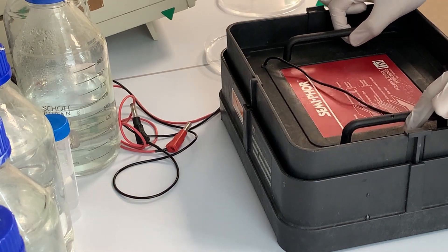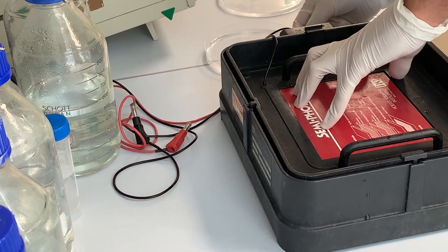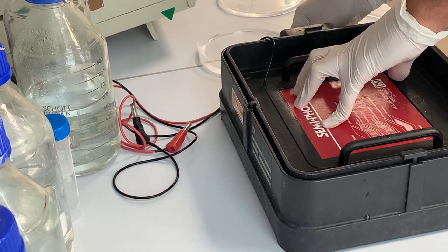I add and connect the lid to the blotting chamber and add three weights on top to assure that the contact between the two electrodes won't break off during the run.